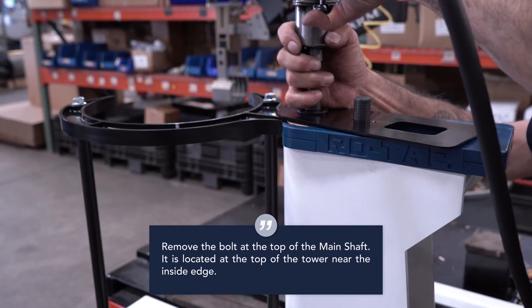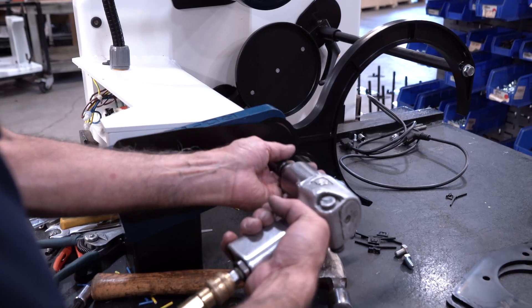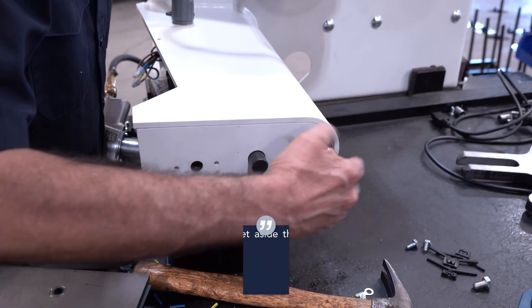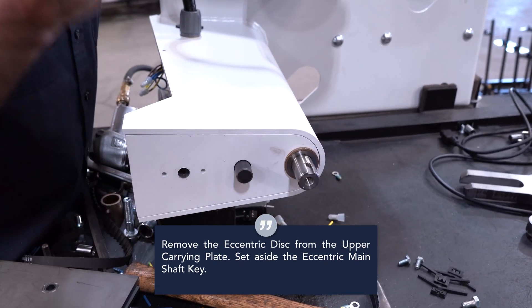Remove the bolt at the top of the main shaft. It is located at the top of the tower near the inside edge. Remove the upper main shaft washer, sheet guard, and rotating guard. Remove the eccentric disc from the upper carrying plate. Set aside the eccentric main shaft key.